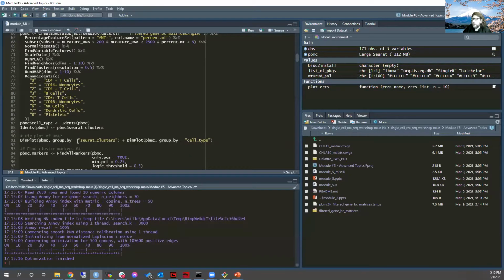Okay. And just to reiterate, we run these. Does anyone remember why we include this line on 87? Does anyone remember why we did that? Feel free to put it in the chat if you remember, or just unmute.